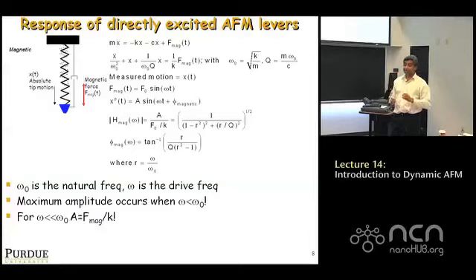The key thing is, it's non-zero. You apply it slowly, it's going to bend slowly, right? But it bends, and you measure it. However, if you go to high frequency, way above resonance, what's going to happen? If R goes very high, you find that the amplitude approaches 0. So if you shake far above resonance, the amplitude is going to become smaller and smaller until it basically dies, all right? That's what this theory would suggest.